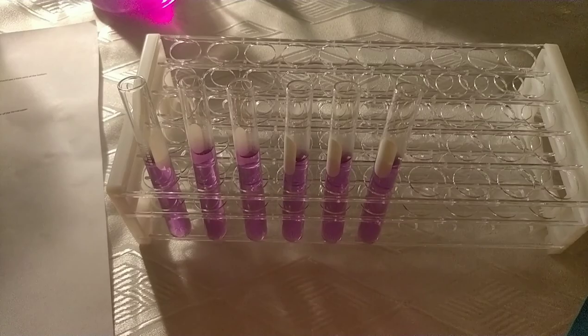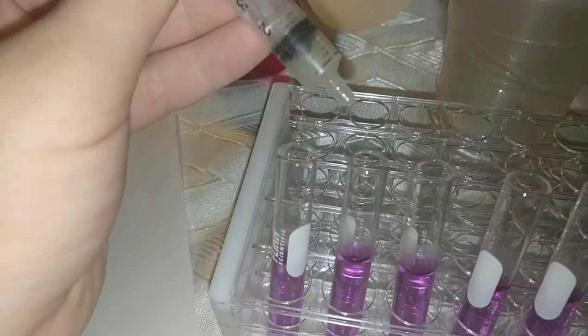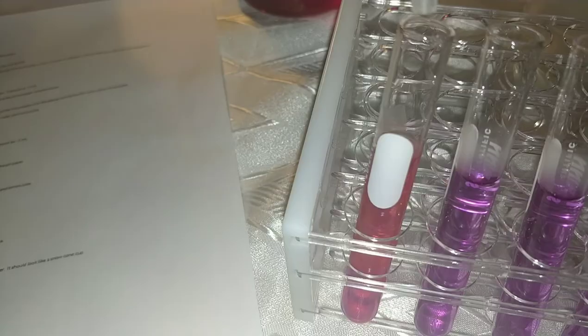Here I have the six test tubes with the cabbage juice indicator in them. I'm going to start with the lemon juice as instructed. I'll use the pipette to measure out exactly one milliliter of lemon juice and put it into test tube one. As you can see it's turned red, so for the lemon juice we'll write it down as red.